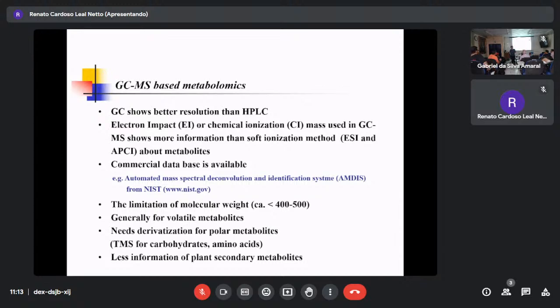Because in gas chromatography, any compound should be volatile, right? Yes, otherwise they are not moving through the column. But cholesterol is moving, even though it is solid. Do you understand my question?